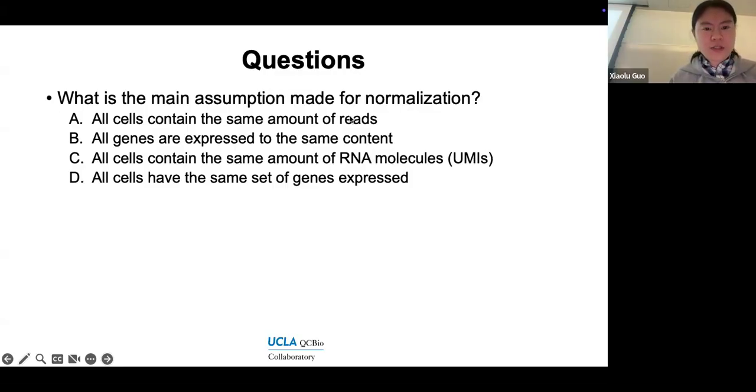And still, what's the difference between A and C? So why is it not the same amount of reads? Instead, it's the amount of UMI. What's the difference?